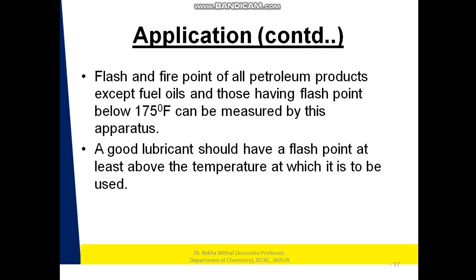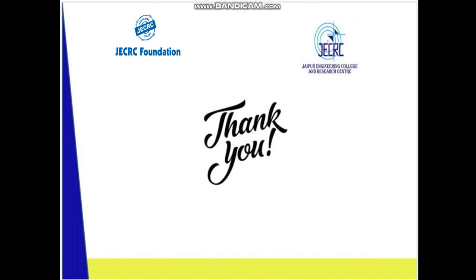The flash and fire points of all petroleum products, except fuel oils and those having a flash point below 175 degrees Fahrenheit, can be measured by this apparatus. A good lubricant should have a flash point at least above the temperature at which it is to be used. So this is all about the experiment. Thank you.